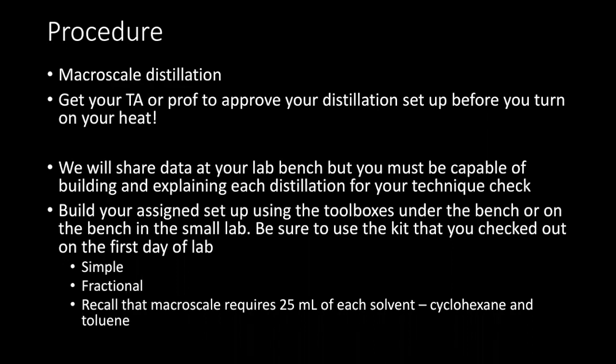You will be building your distillation apparatus using the toolboxes that you checked out in the first week of lab. For those of you in the large organic lab, that means your toolbox kits are underneath the bench. In the smaller quant lab, PChem lab, if you recall, your toolboxes got put on a side bench in that lab. Be sure to use the kit that you checked out on the first day of lab. You're responsible for the glassware in that.